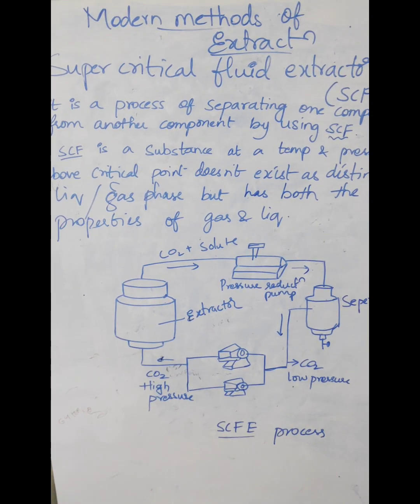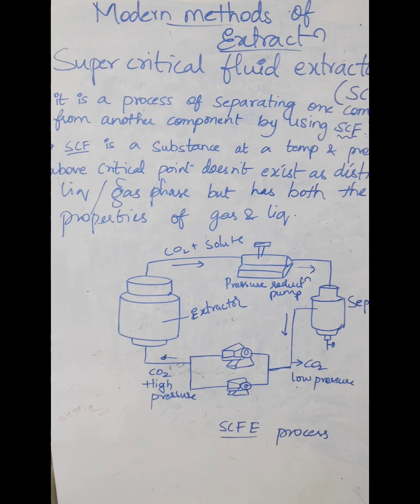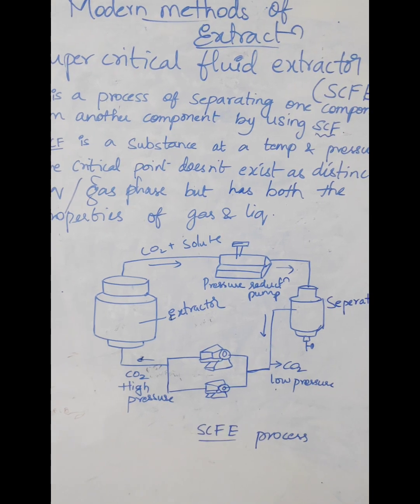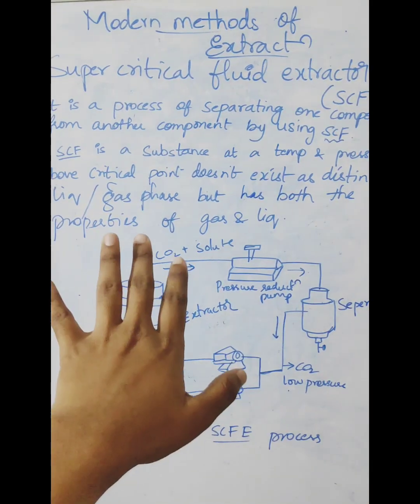Hello guys, today I'm going to explain about the modern methods of extraction. The first one you have is the supercritical fluid extractor, also known as SCFE. So let us understand, what is this exactly?